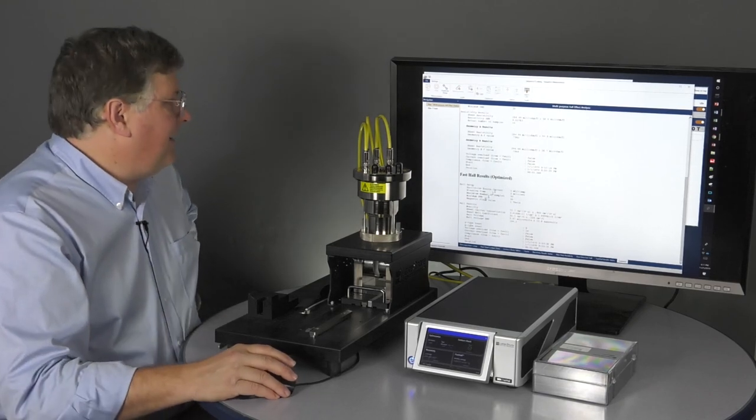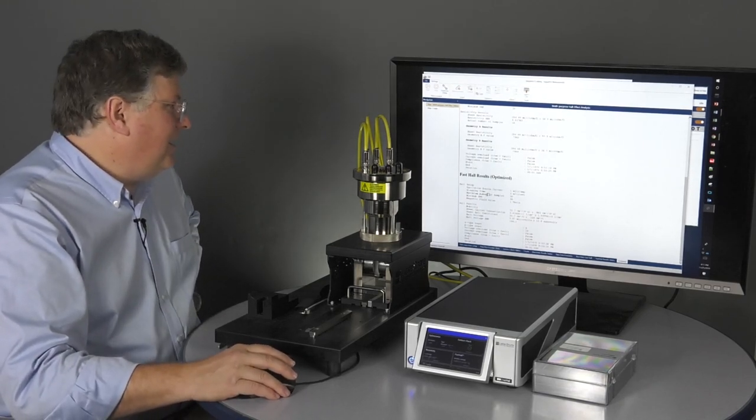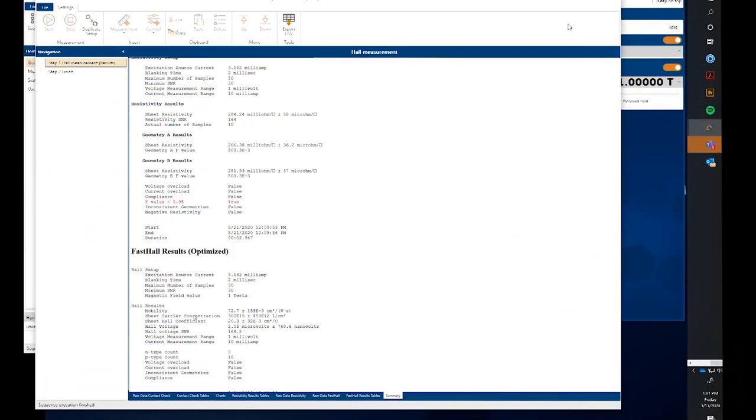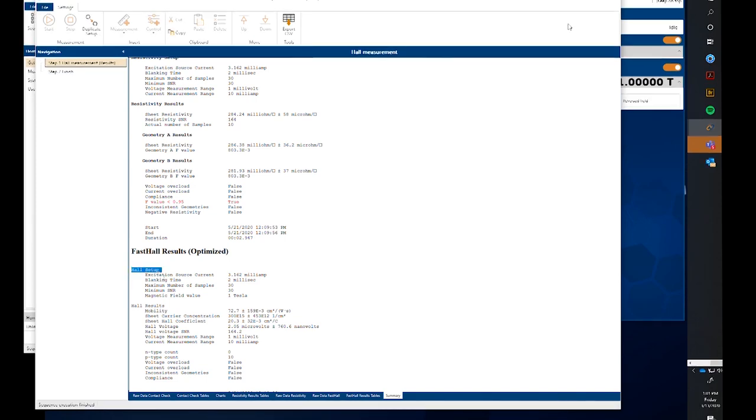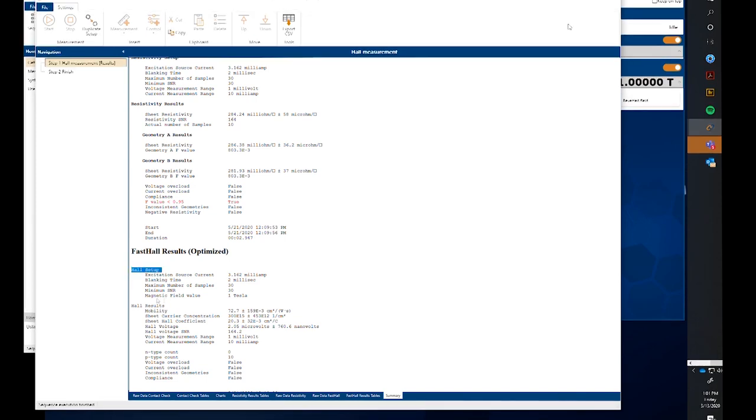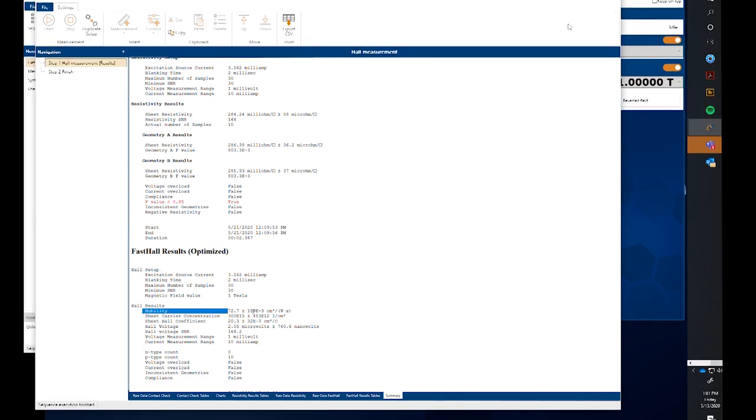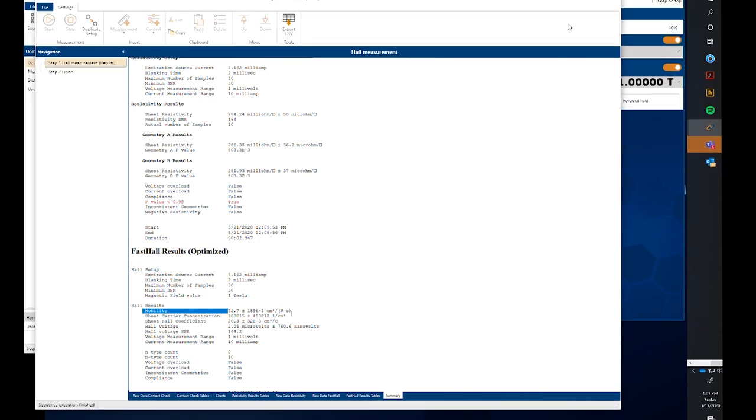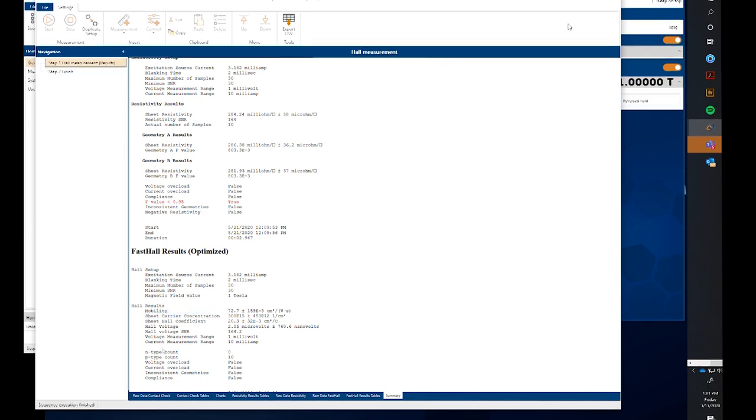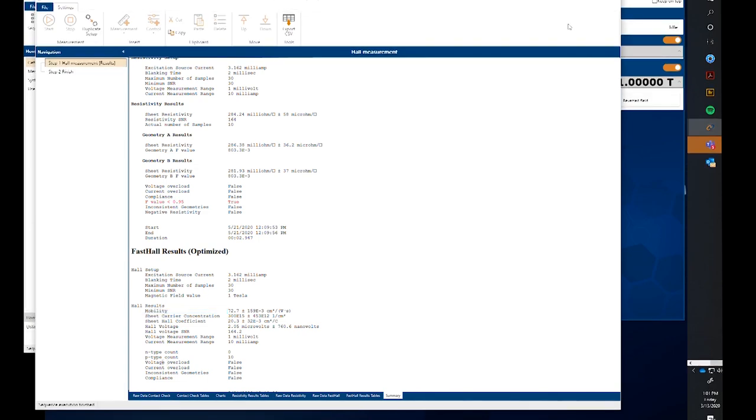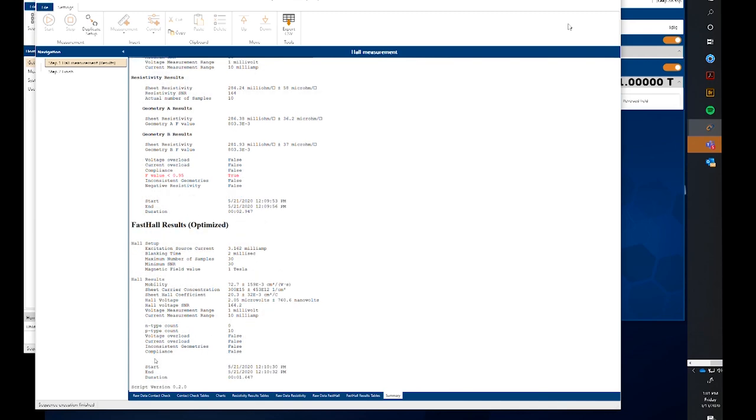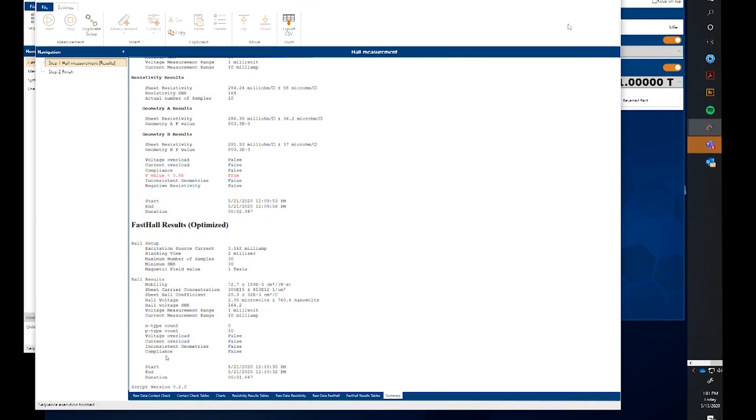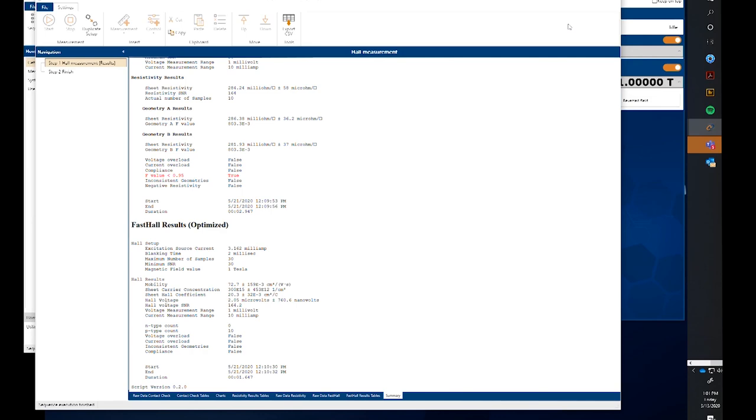Down here in the fast hall, so we have the setup information here. The mobility has come out to 72.7 centimeters square per volt second. So that's pretty appropriate for this p-type silicon sample. Again, a statistical analysis. Notice here that our hall voltage was actually 2 microvolts. And our signal-to-noise was 164. So not too bad.